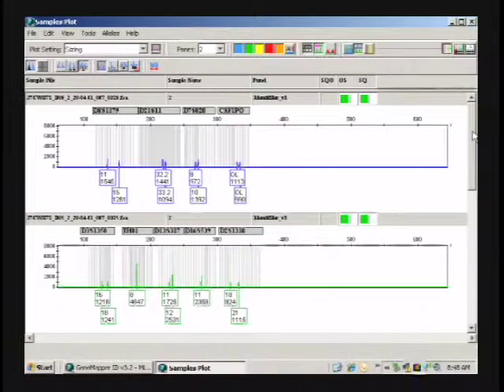But basically with this one, after you do your PE wash for 1 minute, you're supposed to do your 1 minute dry. This one forgot to do the 1 minute dry. And still we got an increase in peak heights. I mean, this would have been 0.1 nanograms. So this actually went up by maybe 5 to 10 fold. So actually still got a big increase.